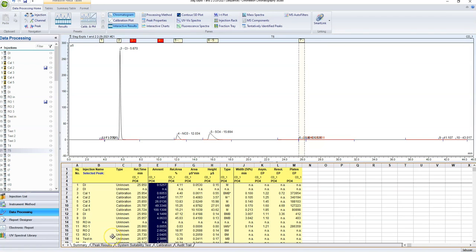So don't play around in somebody else's files because you could mess up their processing method. Play around in your own. And ideally with your own processing method, something that you made yourself. But I'll talk about some of the most useful tools right now.